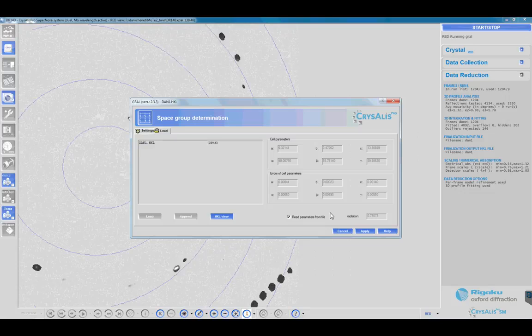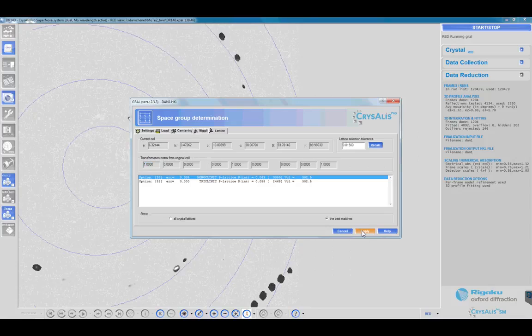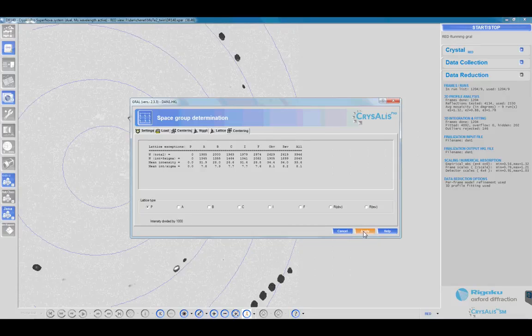Okay, the integration is finished already, and here's our space group determination wizard. I can click through all that stuff. We see that the RInt difference for monoclinic versus triclinic is not too big, so we should be okay with monoclinic. There's no centering of the lattice.